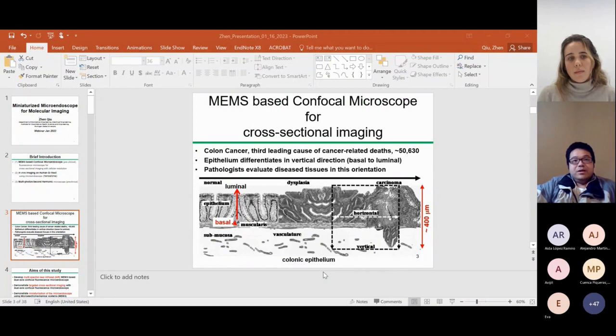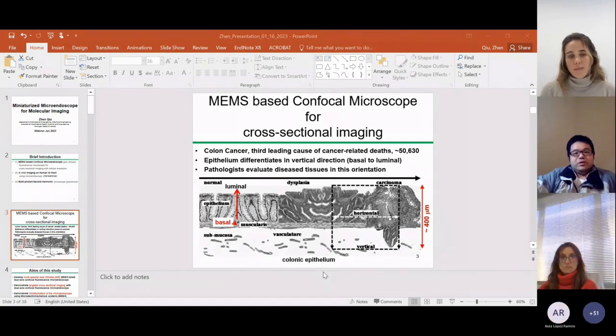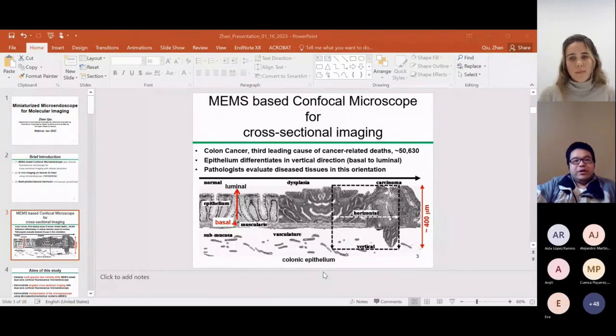And for the second one, the multiphoton, if you're using second harmonic, yes, the signal to noise ratio will drop a lot, because you are not relying on the dye itself. It's relying on the autofluorescence from the tissue. And it also depends case by case on what kind of tissue you're imaging. For example, imaging the collagen in the tail is very strong because the tail has a lot of collagen. But if you're imaging others, for example NADH or FAD, the signal to noise ratio will be quite low.